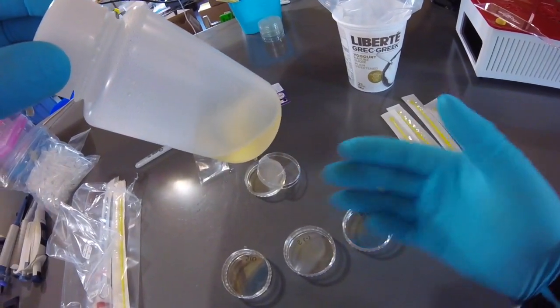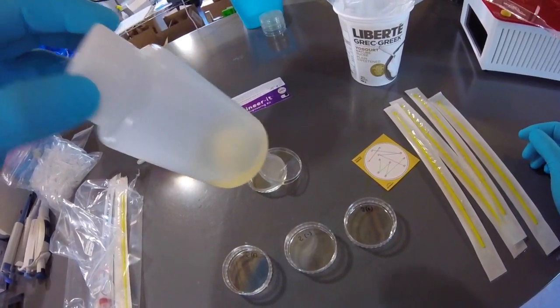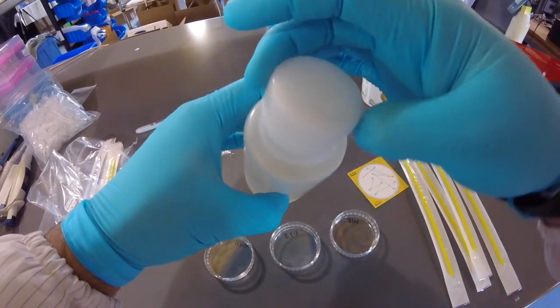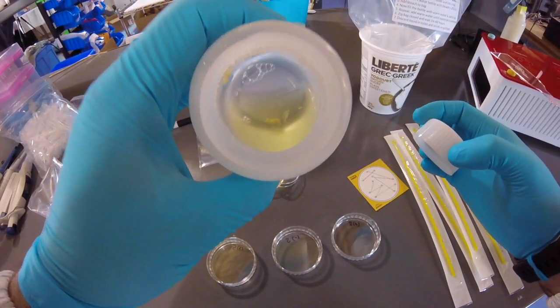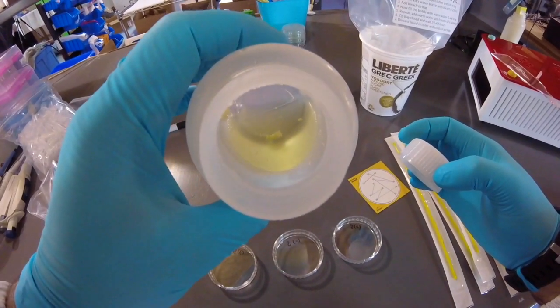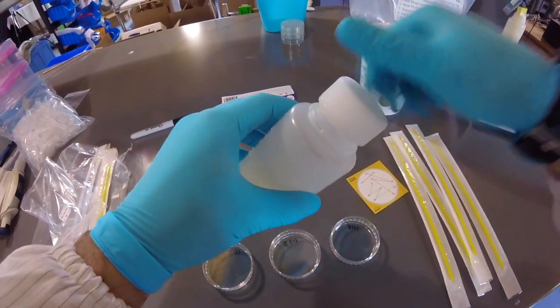See how I'm not introducing too many bubbles in there? I can see a few. Let's just open it up, have a look. So you can see the pill is starting to dissolve, but it's still a little ways to go.